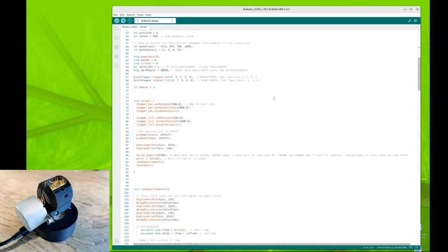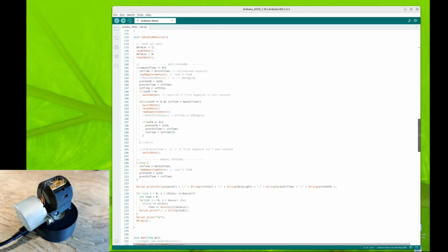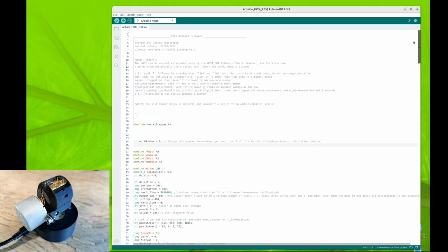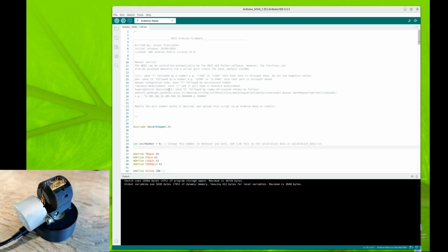So this code is just doing a bunch of stuff to read the spectrometer. It's sort of heavily based on the OSPRAD code. And you can actually interact with it in certain different ways. But first, let's load this to the board. So first you need to go verify, and it will compile the sketch. So done compiling, it's all happy with that. That means all the libraries and so on are there. And then you just need to press upload. It will recompile it and now upload it to the board.